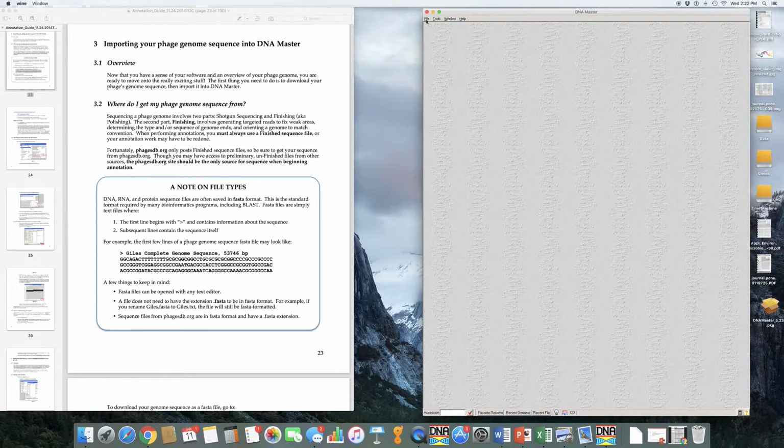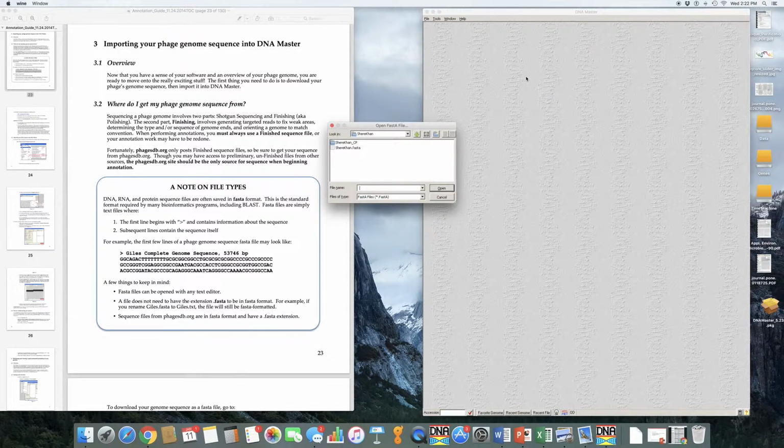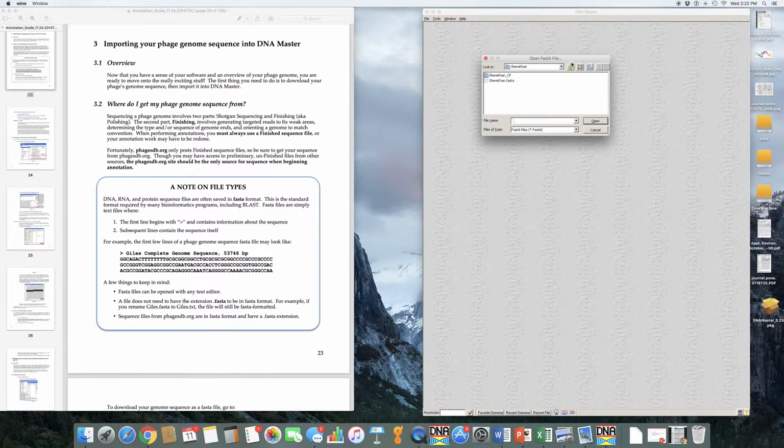What you want to do is go to the menu and click on File, Open, and then scroll down to fastA Multiple Sequence File. Click. Okay. This allows you to browse your folders and find the fastA file that you want to use in your analysis.